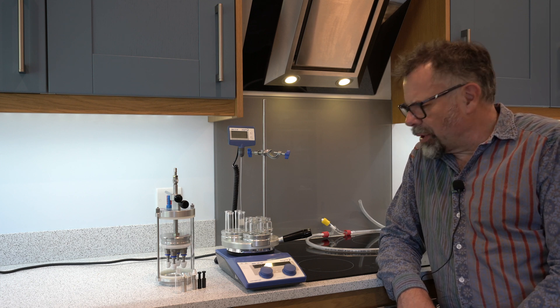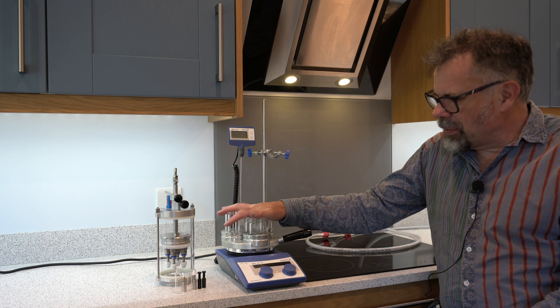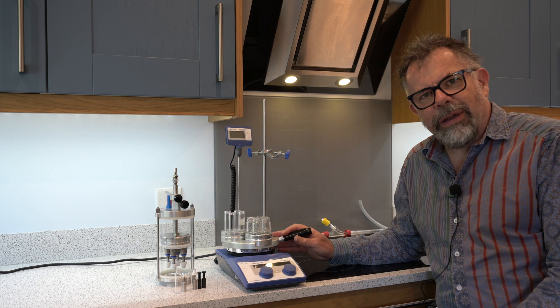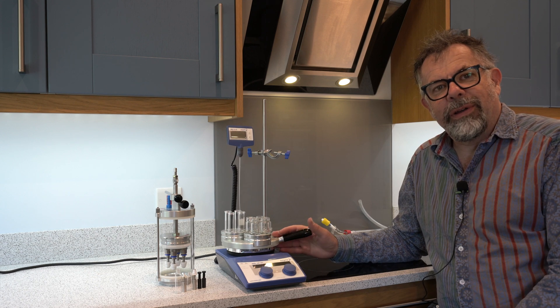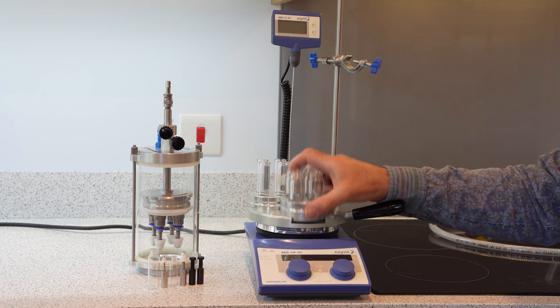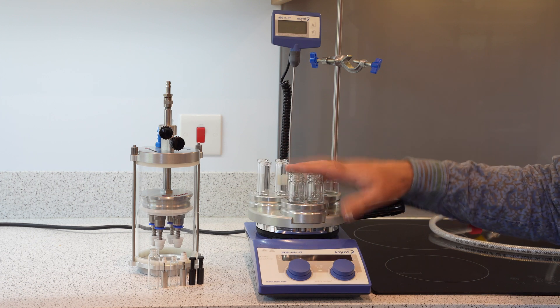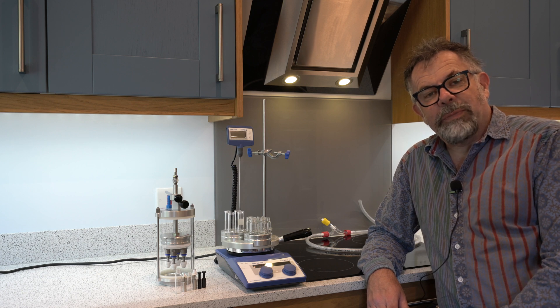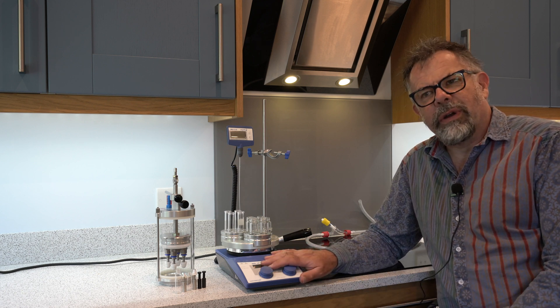What's that all about then? Let's have a look. Many of you will be familiar with our DrySyn multi-range of heating blocks with round bottom flasks, tubes and vials. Here we have some of the multi-inserts in place.